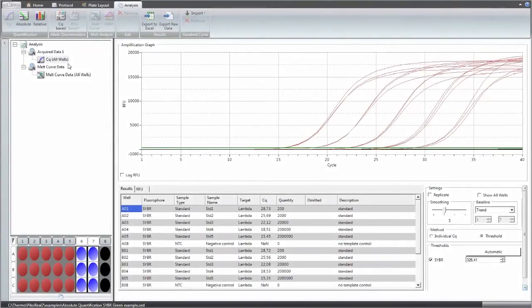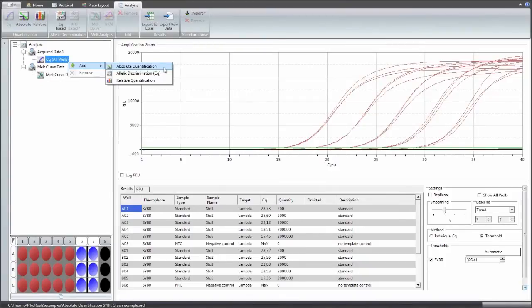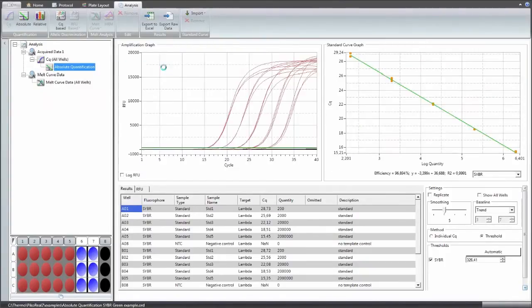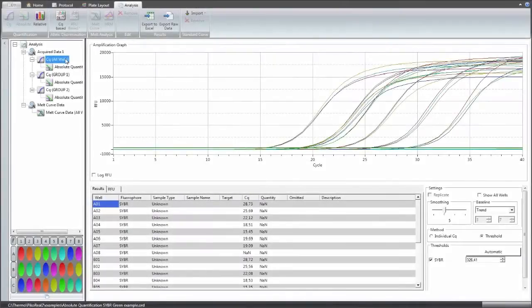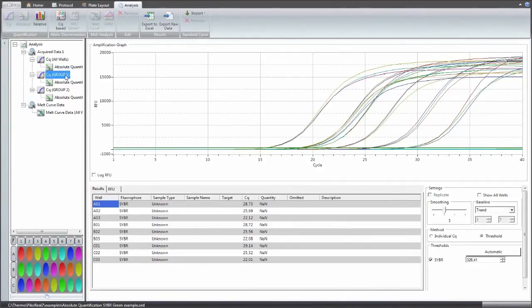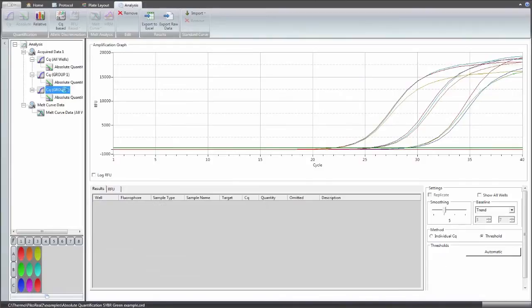After the layout is created, the desired analysis modes are added to the analysis tree structure. The analysis can also be limited to a group of samples to compare different analysis settings on the same plate.